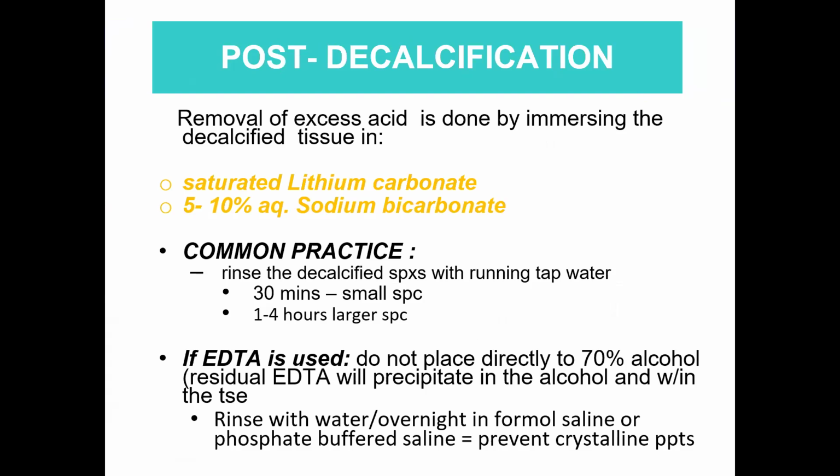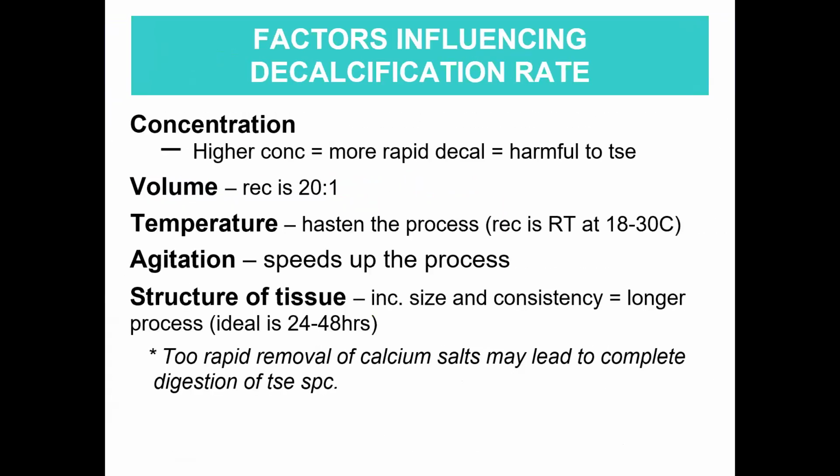If EDTA is used, you cannot place the tissue directly into 70% alcohol because the residual EDTA would precipitate in the alcohol and within the tissue. So if you decalcify using EDTA, you should rinse it first with water, or overnight in formal saline or phosphate buffered saline, to prevent crystalline precipitates.